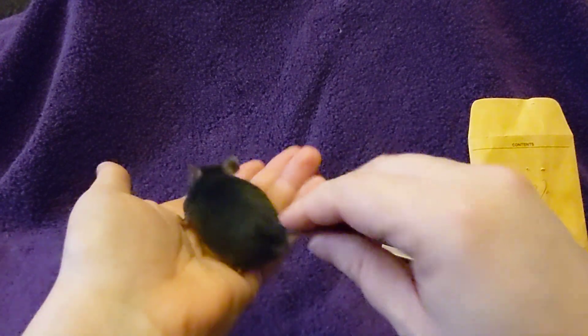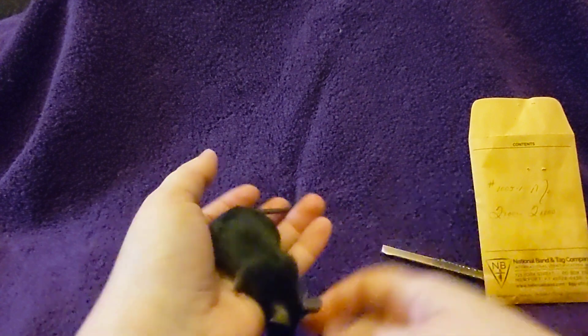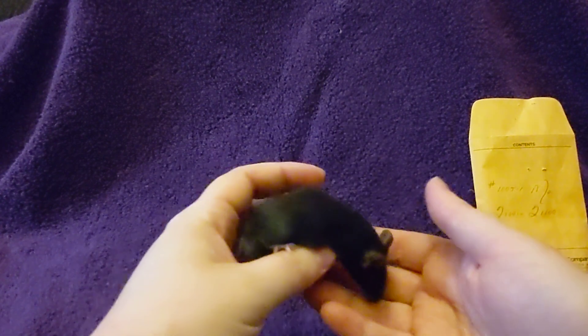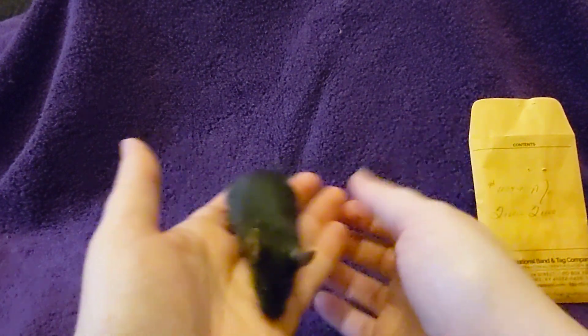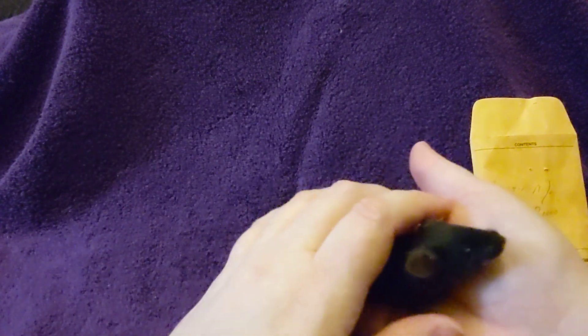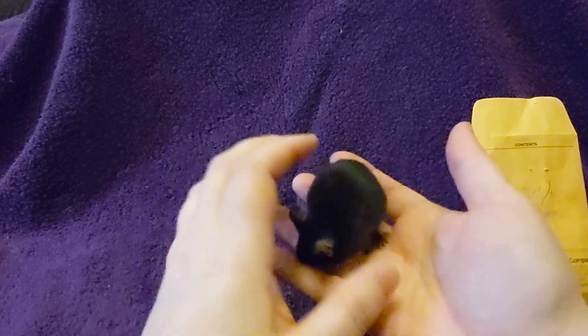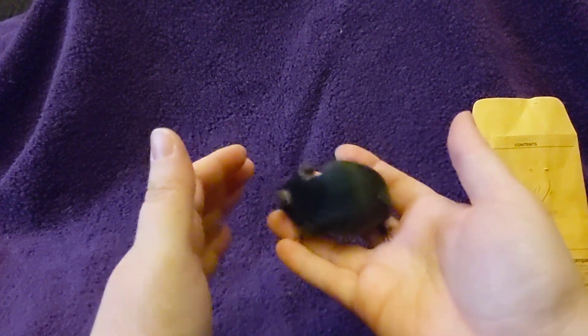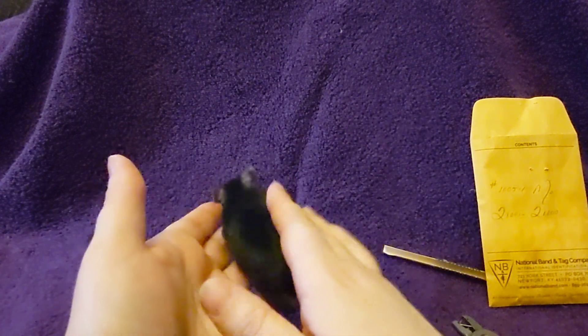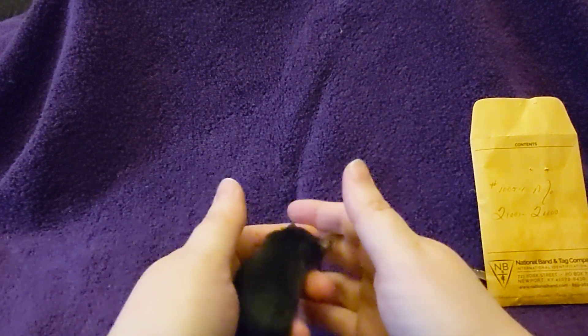In order to apply the tag you are going to have to scruff the mouse to get them to hold still enough. If the mouse moves during application you can actually put the tag through skin instead of ear, and you really don't want to do that. However, if you're new to this and you happen to do that at some point, you just clip the ear tag out with some wire cutters and use the other ear next time.